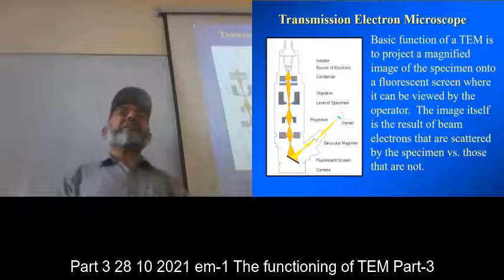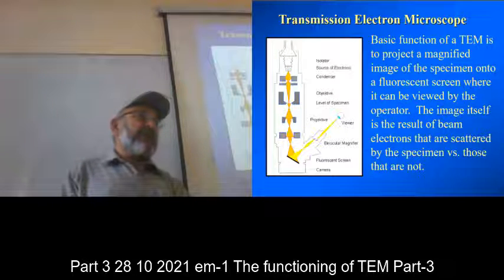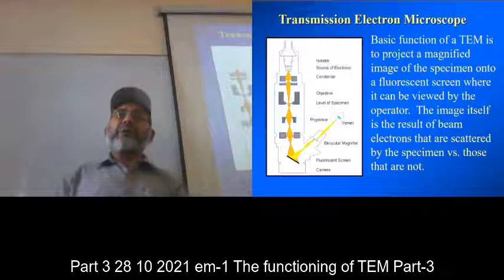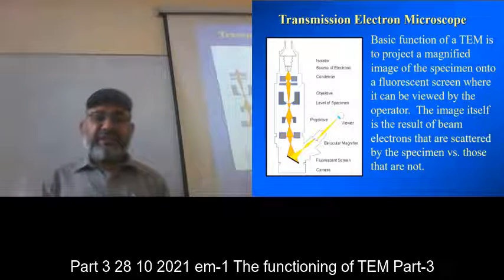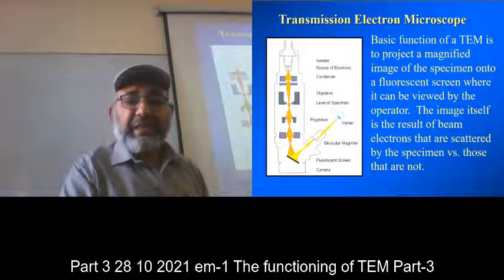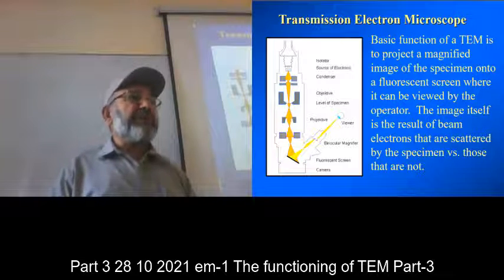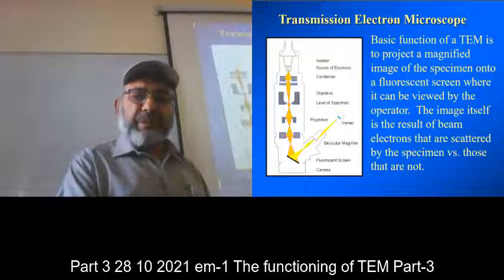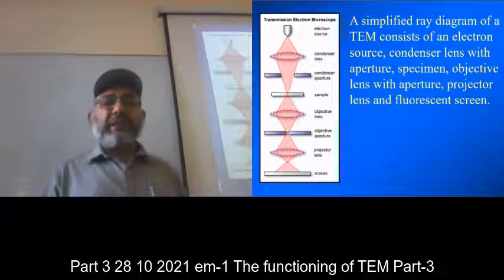So it is not a cheap business. When you are doing microscopy, a lot of funds are required to add these accessories. But a CCD camera is very accurate, and you can use the computer images for interpretation and for diffraction measurements.